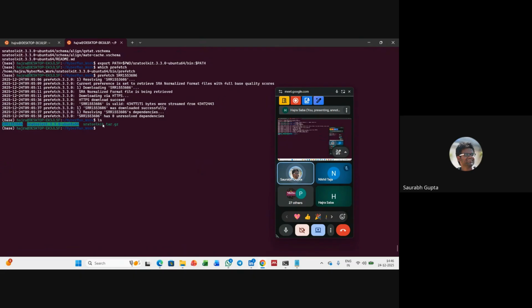Everybody, when you do ls inside your folders, you should see this particular folder, SRR1553606, in your directories. Is there anybody for whom this is not the case? Anyone? Now's the time. Nope. Great.